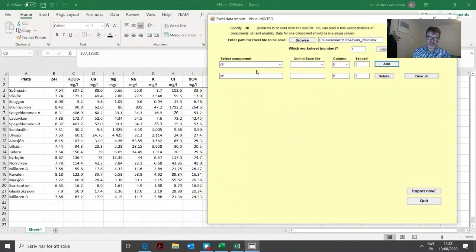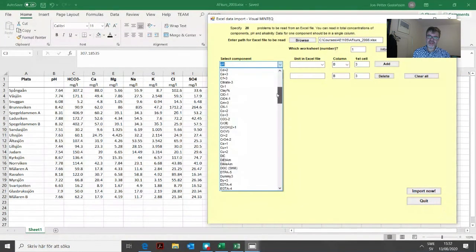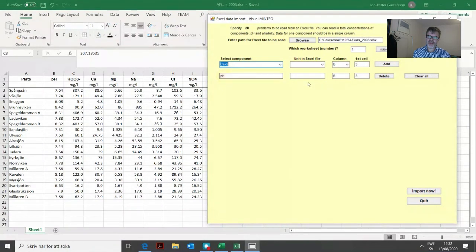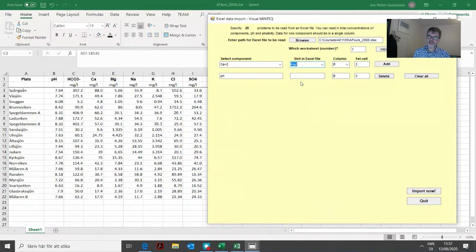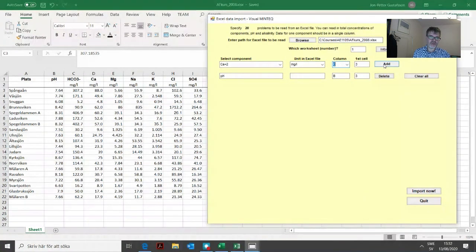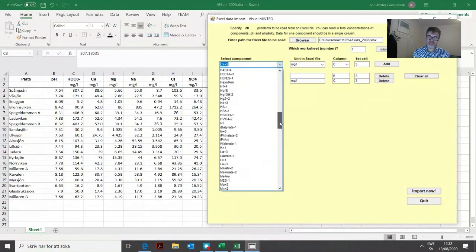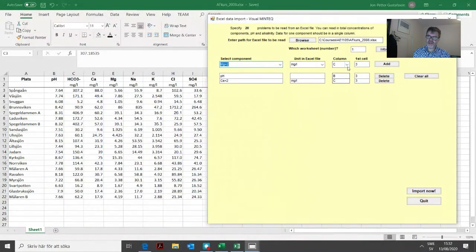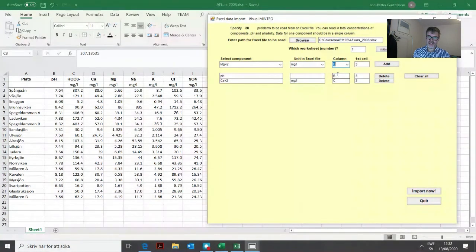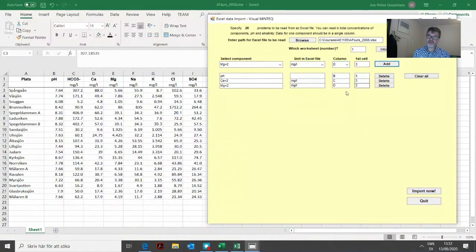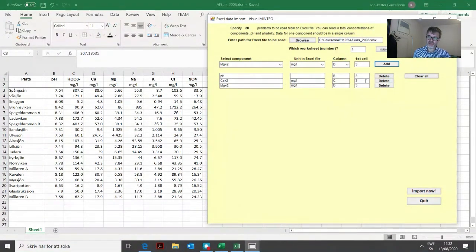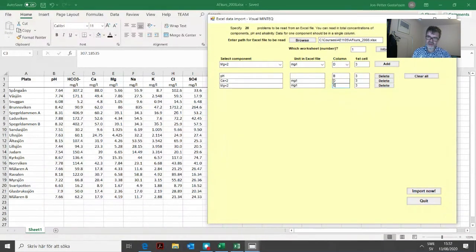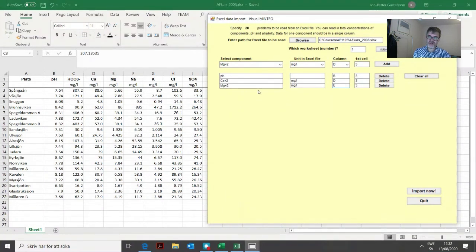Then we go on like this. We find calcium in the next step, Ca2+. It is milligrams per liter, so we choose the right unit. We have column C in the first cell three. Then we have magnesium in D3. When you've added wrong columns, you can just change these letters. Calcium should be D and magnesium should be E.